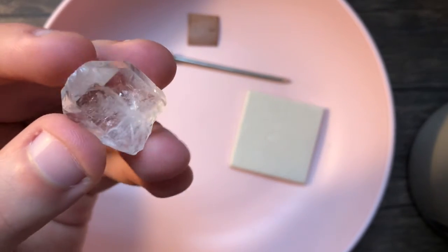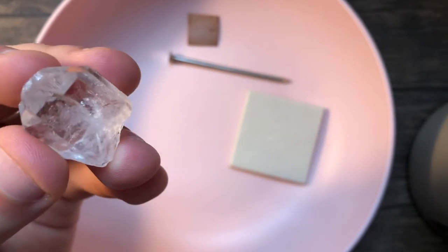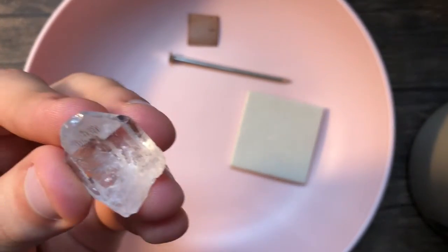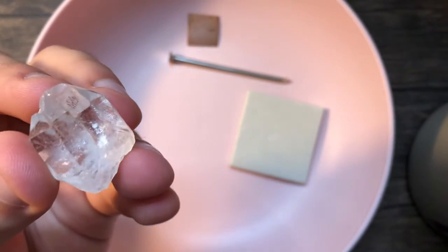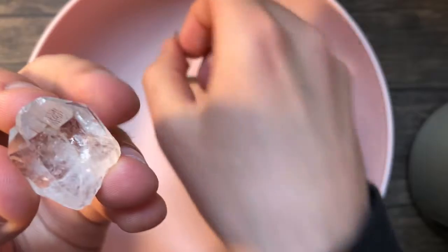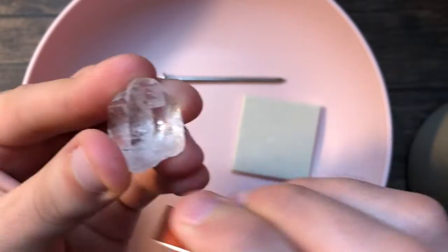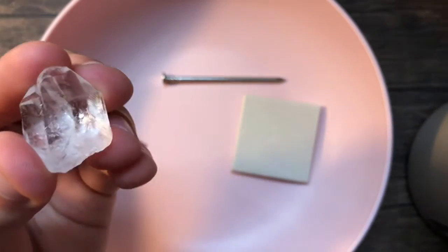So again, that'll be measured by how well it resists scratching from other materials. We can start with a fingernail. If the mineral is scratched by a fingernail, it's likely a 2 or a 3 on the hardness scale. It was not scratched by the fingernail, so we know it's harder than that. Next, we can use a copper plate. If it's scratched by the copper plate, it's likely a 3 or a 4. It was not scratched by the copper plate.